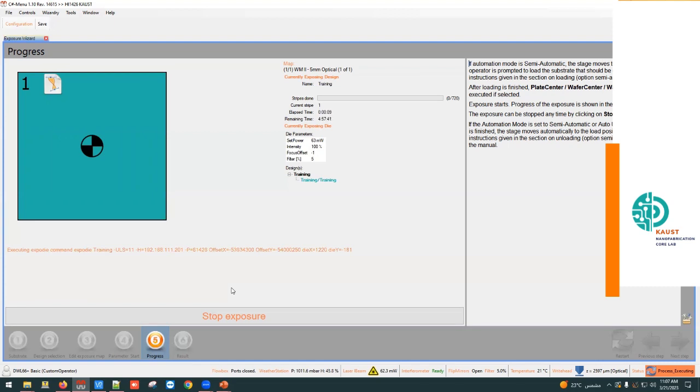In fact, this was one of my questions to the engineer as well. Do we need to wait a little bit of time to warm up the laser? He said no. The only laser that needs to warm up before we use the tool is the interferometer laser when we completely shut down the tool. But this is not going to happen to you, because this is just in case we switch off the tool by emergency or because there is a power shutdown or whatever. The first time we enable the tool again, we need to wait at least 30 minutes for the interferometer to warm up, but nothing else. So you don't need to worry now about switching on the laser.